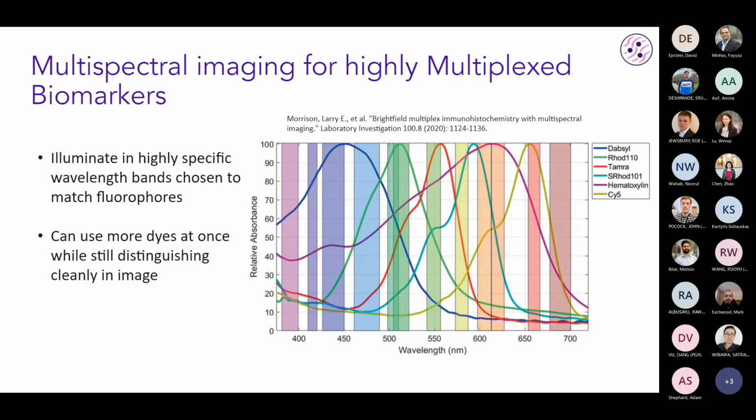So I guess the change in focal length is much less than, when you're talking about the imaging system, when you're looking at a fairly small wavelength range, it's perhaps not relevant, which might be why I've not seen that specifically mentioned anywhere. And then in some of the later things, you're using laser illumination, and there's not that to worry about anyway. So did that answer the question, David?